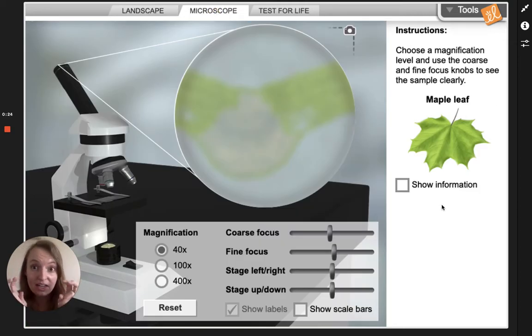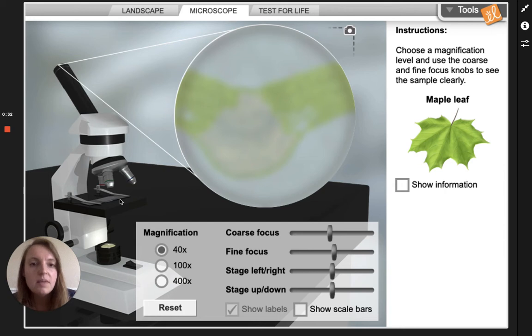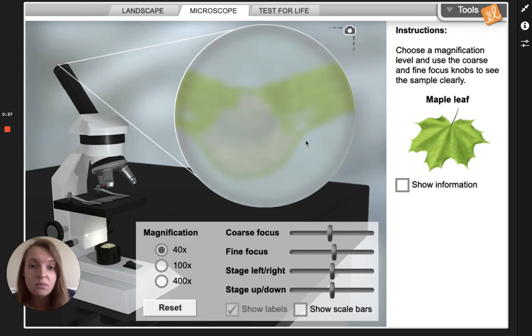Virtually, we've taken this leaf and put it on a glass slide and put it under the microscope. There's our slide right there. When you look at this in real life it would look like this — it would be blurry. So we need to focus our virtual microscope.